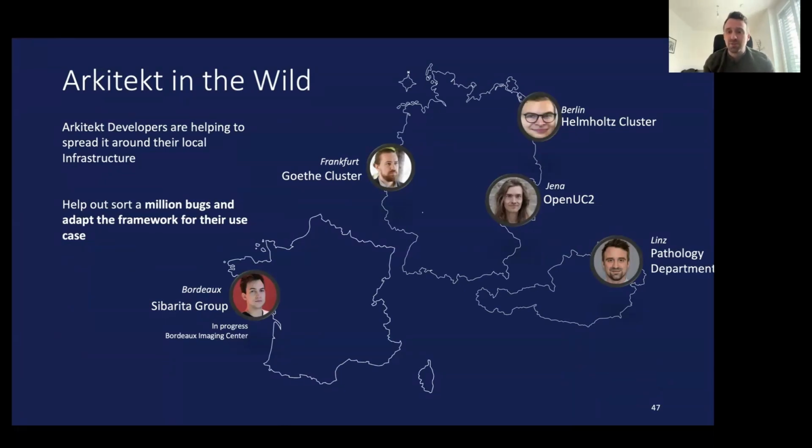More and more people are adopting it, including running it on larger computational structures, where you don't need to run your own Arkitekt server. My goal is to have a few deep learning algorithms that everybody can access: send the data to the server, run the deep learning model on it, and send it back. That's what we're working on.